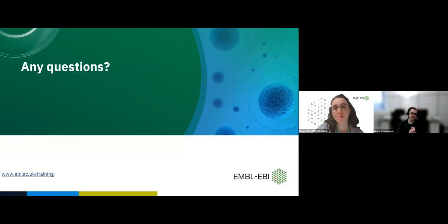But there is the spatialdata-io package, spatialdata underscore io, which has readers for most technologies, and those would take directly the raw folder from the instrument as input, and then the object coming from the reader can be directly opened in Napari.